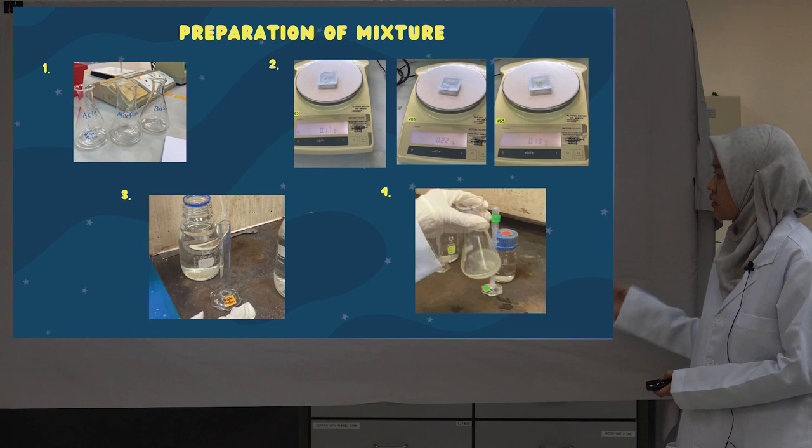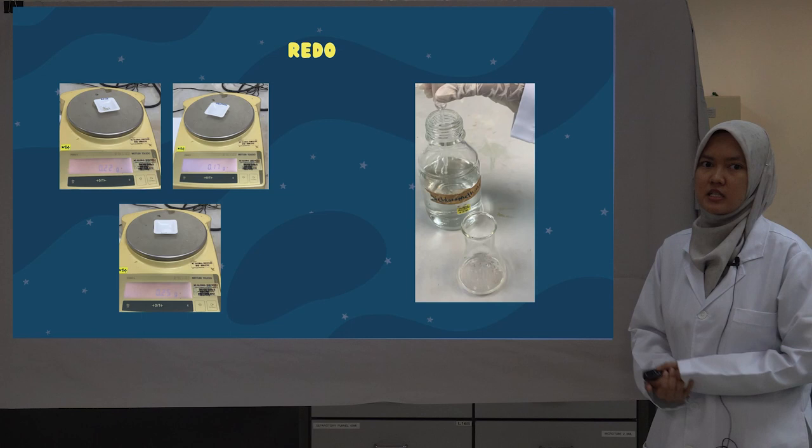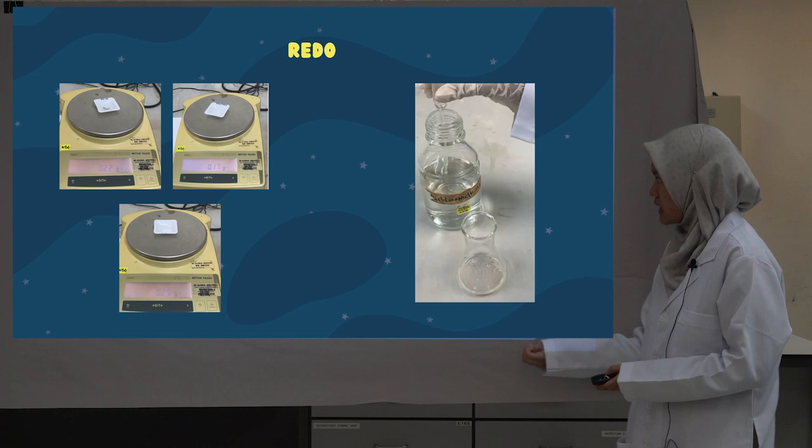But due to some error because of the expired DCM solution, we had to redo it by weighing the compounds again and putting them in the mixture flask, and dissolving them with the latest DCM solution, also 10 ml.